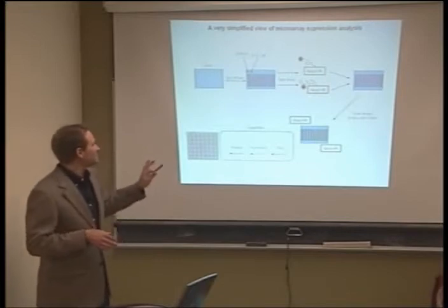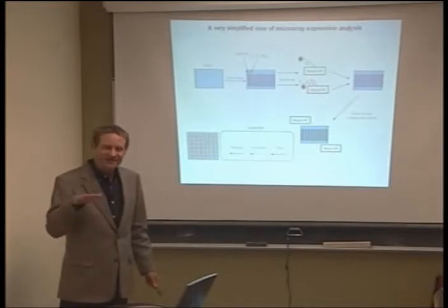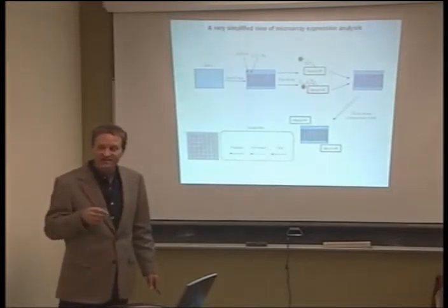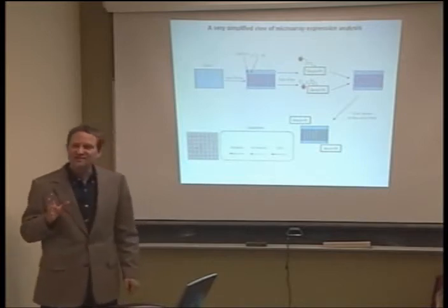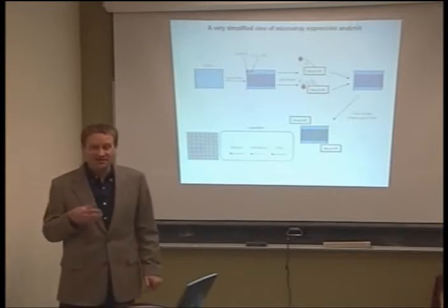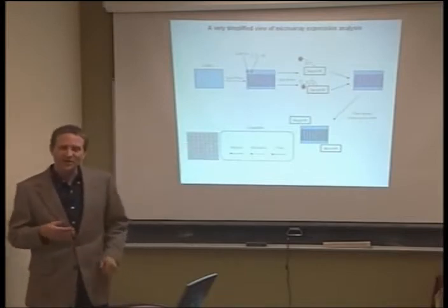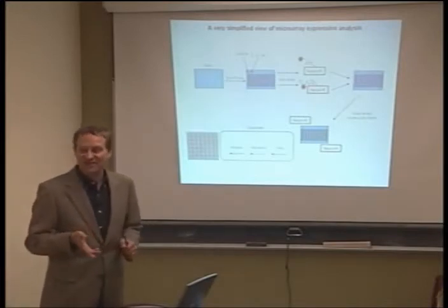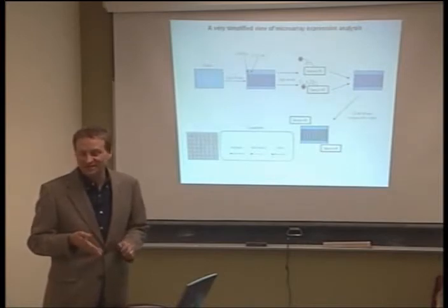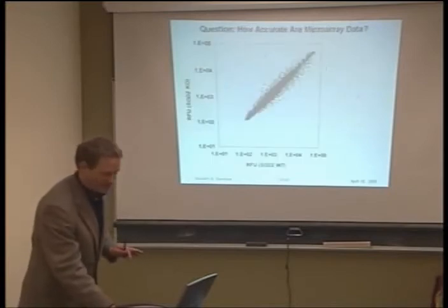And I'm not going to go over this except to say that microarrays, like the arrays I just described for genotyping, are flat substrates in which you've made lots of little spots. And there are a lot of different ways to make them, as I kind of showed in that diagrammatic figure. And each one has got a different sequence that allows you to measure the amount of the transcript, the mRNA, of a given gene. And that gives you data, ultimately. And typically, this data can be for 1 or 2 samples that are analyzed at the same time. So it's kind of much slower. It's very difficult to look at thousands of samples by microarrays. But you can look at thousands of genes at the same time quite easily. So it's a slightly different format than genotyping. And of course, it's for a completely different kind of question.